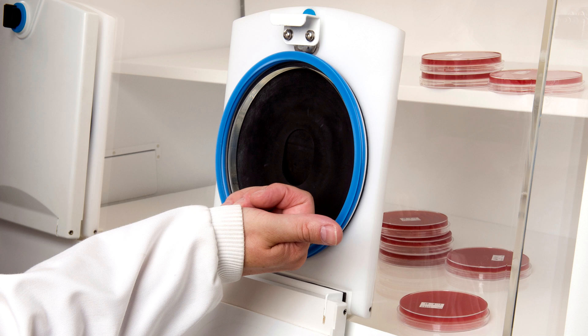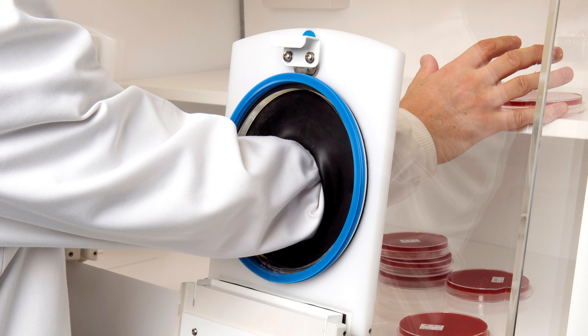The A35 is the first workstation to be offered with our new gloveless sleeveless system. Sample manipulation within a secure anaerobic environment is now as easy as working aerobically on the laboratory bench.